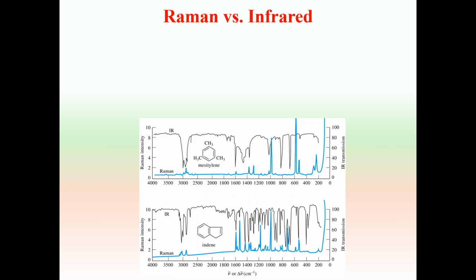Whereas IR spectroscopy needs sample preparation through potassium bromide pellets for observation of gels, films, and liquids. Here you can see the comparison of both spectra, the IR spectrum and the Raman spectrum. The Raman spectrum you can see here in blue, whereas in black you can observe the IR spectrum. So you can observe both spectra in detail. You already know about the Raman spectrum. The FTIR spectrum we will discuss in the coming lecture series on IR spectroscopy.